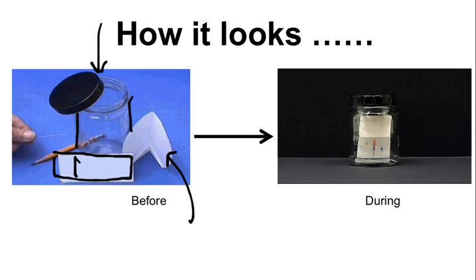While the TLC plate is actually running, if we take a look at that plate now in the drying situation, you'll notice first off there's colors there. So this plate was nice because we see colors, we can see our separate spots. So if we really wanted to, we could go through and say, okay, let's take a look at this pink spot, which you now can't see, so let's try that again. We could look at the pink spot that's fairly low. We can look at a pink spot that's fairly high. Okay, would those two spots be the same compound?